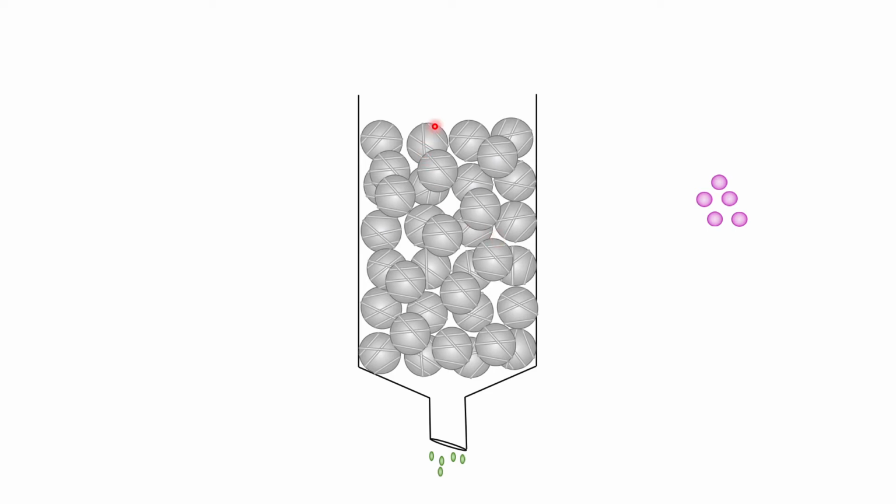If they move through these pores, they simply block the pore and there will be no elution. So elution of fibrous protein by gel filtration chromatography is basically illogical. It simply clogs the chromatography column. That is why we only use it for globular proteins.